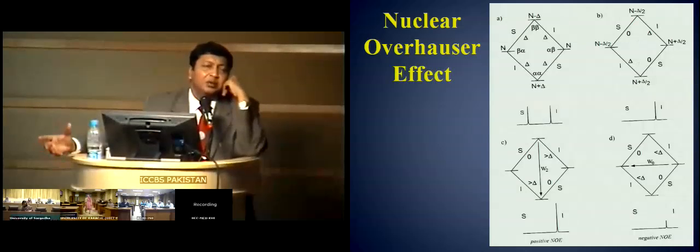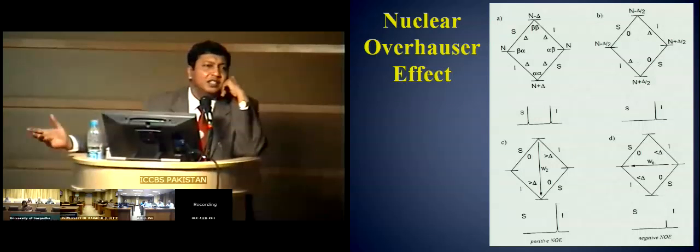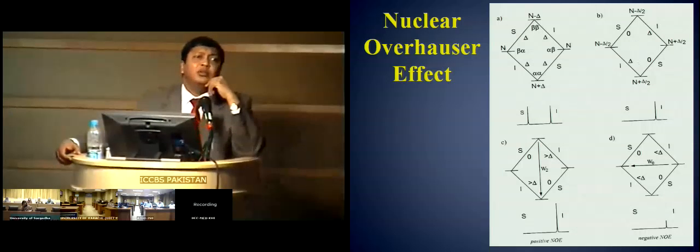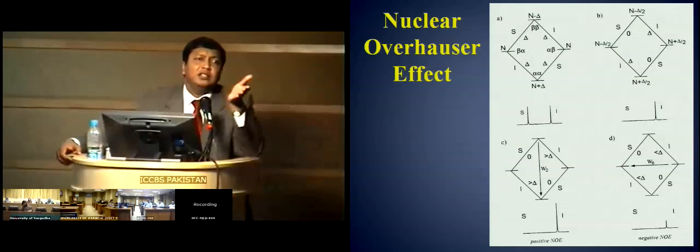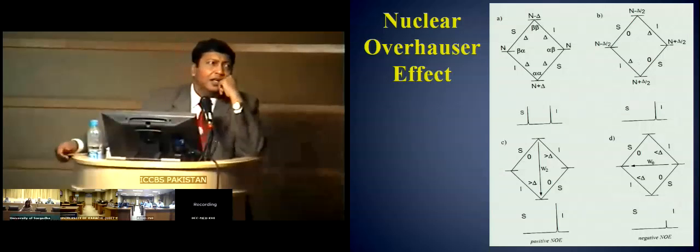You know, if you have toluene, the probability of having the methyl as a C13 and carbon 1 as a C13 and carbon 2 as a C13 is equal. Right? So you just need to have more of a sample, more of a sample, and when you do a polarization transfer, you increase the sensitivity. Anything else? Thank you.